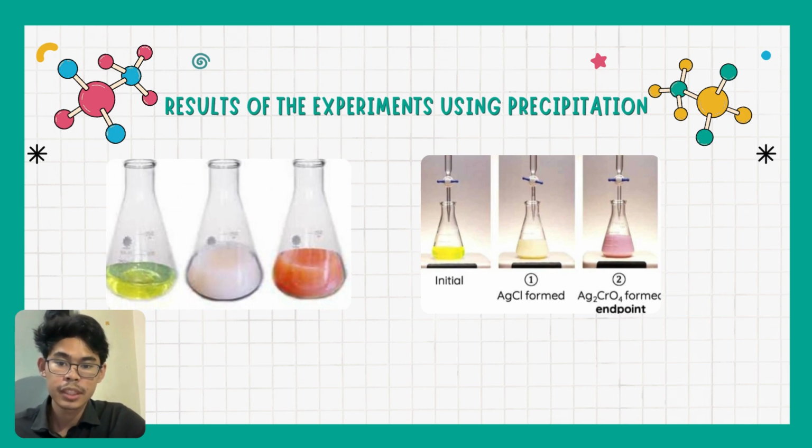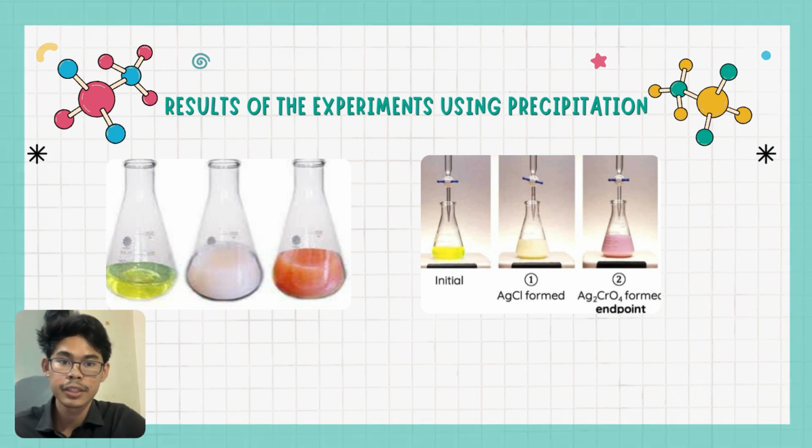Silver nitrate is titrated against chloride ions to produce a white precipitate. When all chloride ions in a given sample have been converted to silver chloride, additional silver nitrate reacts with yellow potassium chromate to produce a reddish brown precipitate. And when the end point is reached, the reddish brown color remains stable and does not disappear when stirring.